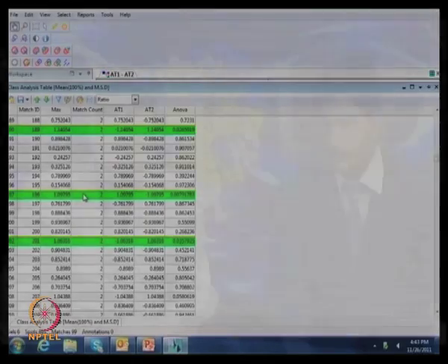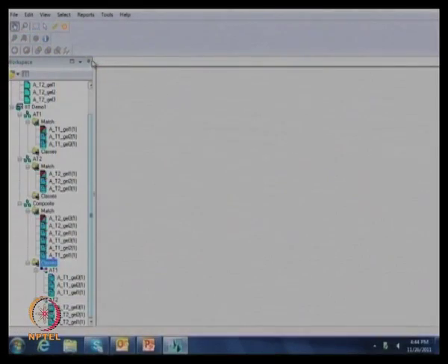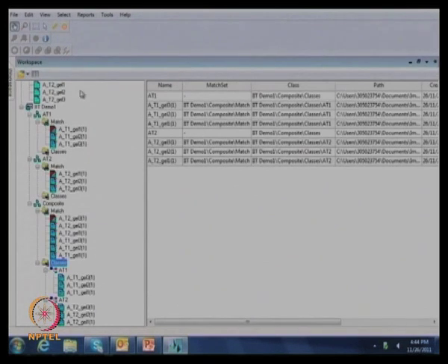So I guess it was very useful to see the different steps required for performing this analysis, and also the software gives you a lot of options for doing different fold change and statistical analysis of how significant the data is. Then one can still go back to those spots which the software says are significant and look at each spot manually to verify that it is a real spot.